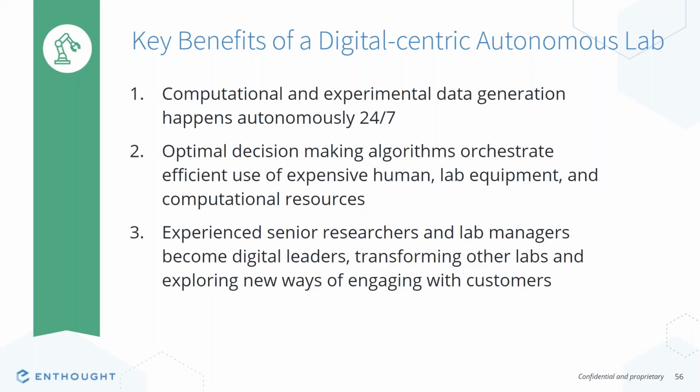So a key benefit of this digital-centric autonomous lab, where you can do it, is that computational and experimental data happens autonomously, 24/7. And with this data, optimal decision-making algorithms can be implemented to orchestrate efficient use of expensive human lab equipment and computational resources.